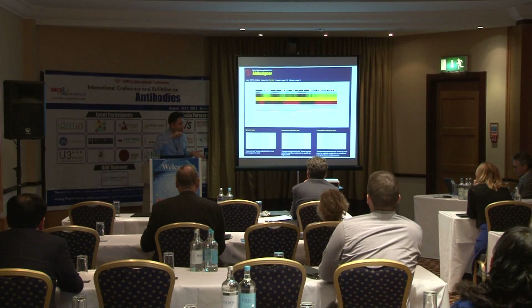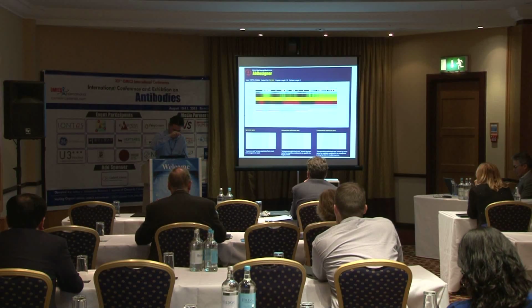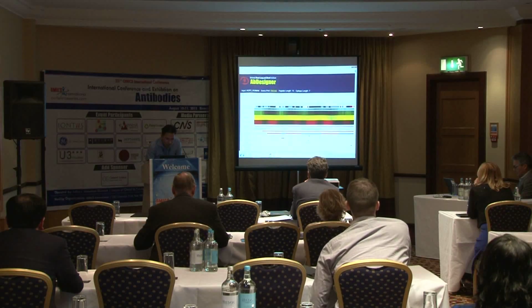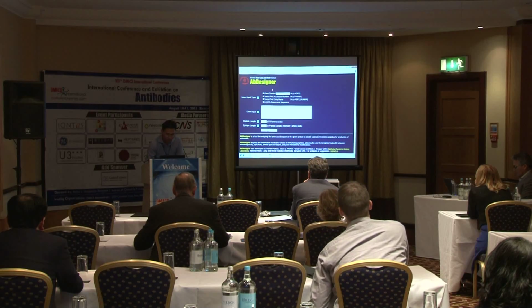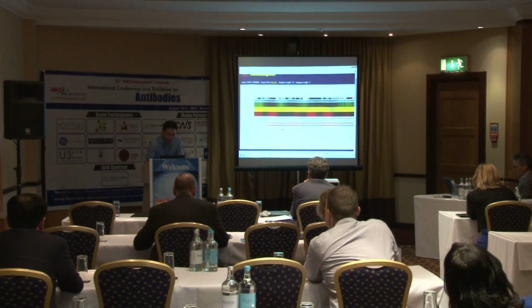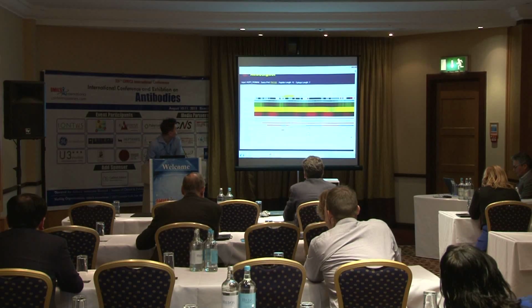Once you put that in, it will give you a Java applet, an interactive visualization. Let me show you right now how it looks. So this is the real website. I just put in one of my favorite proteins, aquaporin 2, and this is the output. You can see it's interactive and you can mouse over it. I will go through a little bit of this output to explain what these things are telling you.